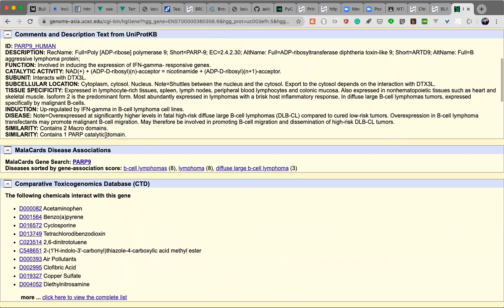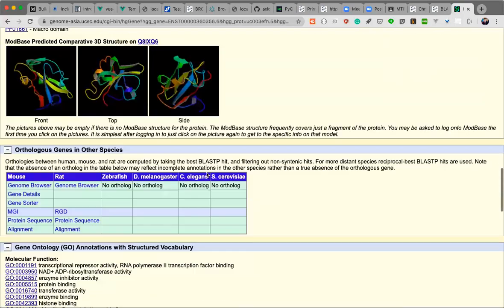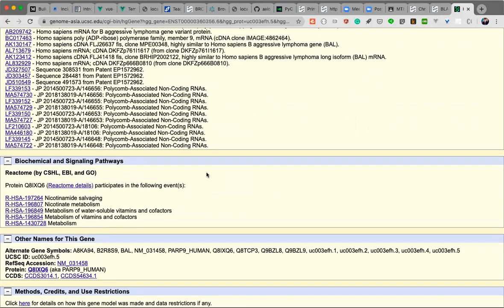I don't quite remember, but there's a link that you can use to get the sequence right away. Sometimes the website changes the interface a little bit, so it's quite difficult for us to find what we used to find.